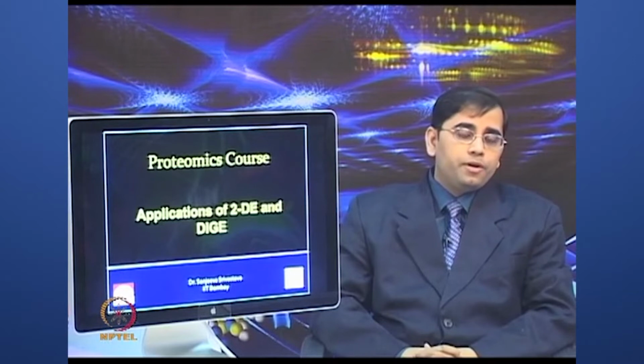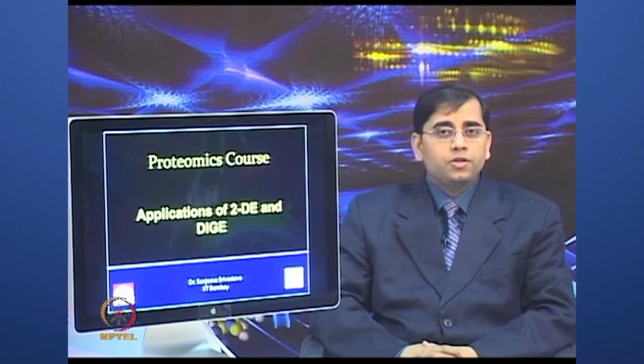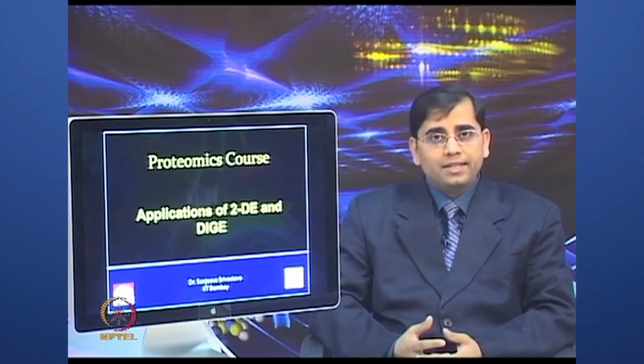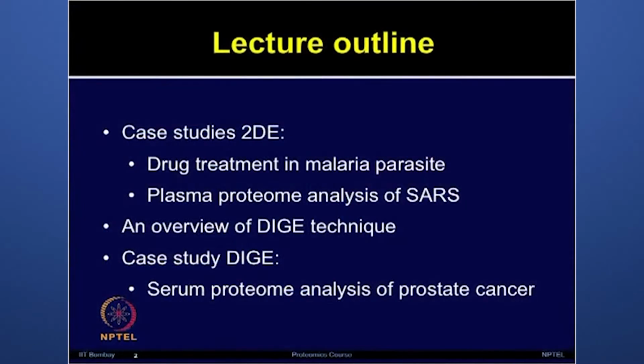So, let us continue today's lecture from the same theme, and let us discuss some more case studies on how people have employed two-dimensional electrophoresis, the power of this technique to resolve thousands of proteins and compare those for various differential proteomic applications. So, in today's lecture outline, first we will continue our case studies on conventional two-dimensional electrophoresis.